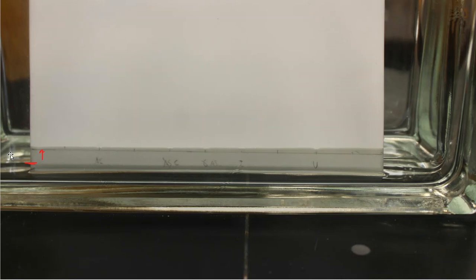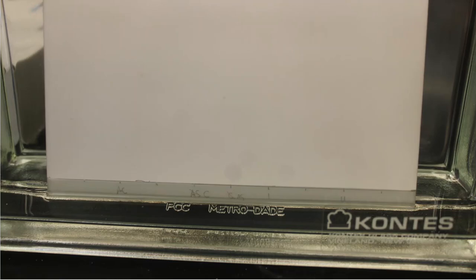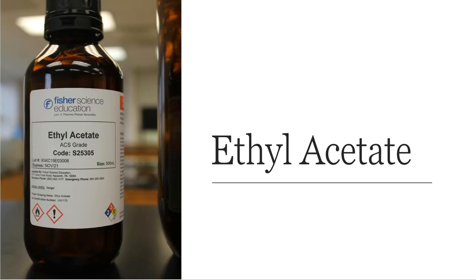So this is tank number 1, which is just ethyl acetate. This is tank number 2, that is my simple hexane only. And then here is tank number 3, which is my 50-50 mix of hexanes and ethyl acetate. I keep saying ethyl acetate. I want to go back for just a second, and talk about that name and that structure.